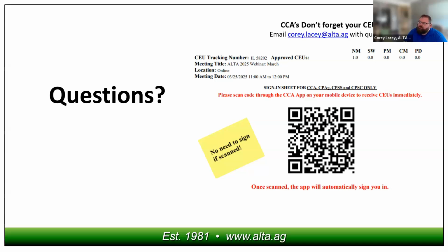Because I know there are some labs that are adding an internal standard inline, as you mentioned, so the sample's being brought into the ICP, and as it's being brought in, the internal standard's getting mixed at the same time, as opposed to adding the internal standard somewhere in the extraction or post-extraction process to the sample.